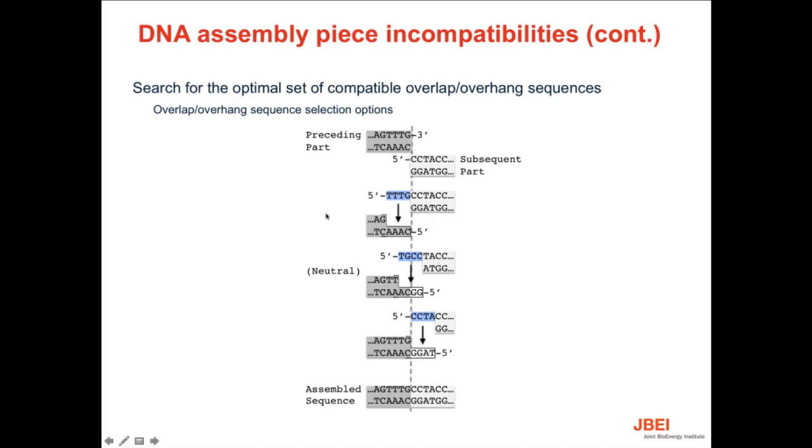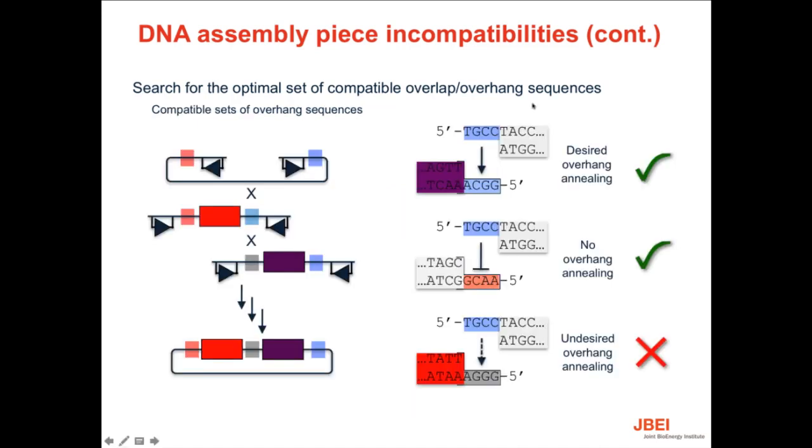Now, again, this can be a little bit tedious and time consuming, and if you don't have software that can help automate that for you, that might be pretty laborious. I should just note in passing that I've been emphasizing scarless approaches, where you always get exactly the same sequence that you want. And the trade-off here is it really does take a little bit more effort on the design side to make sure that all of your processes are going to work efficiently.